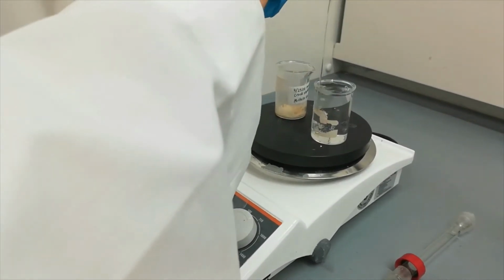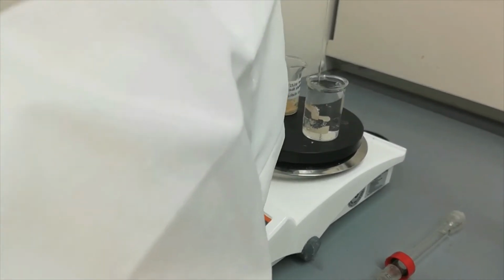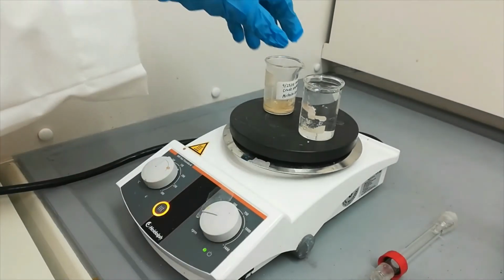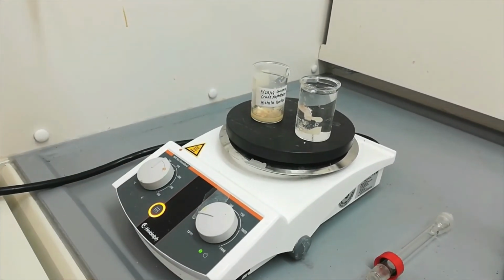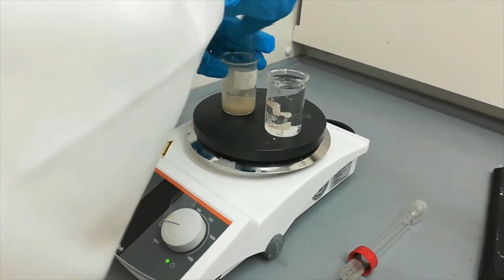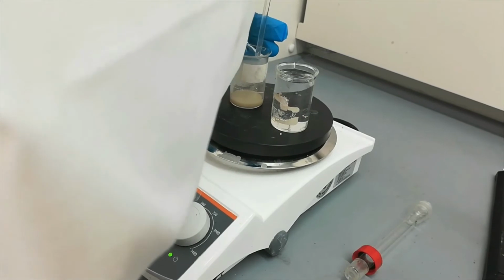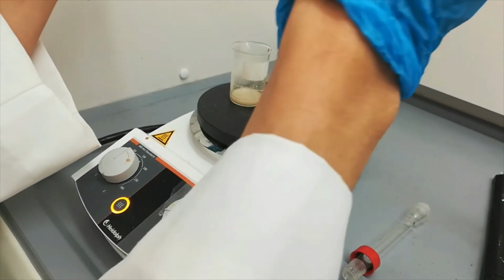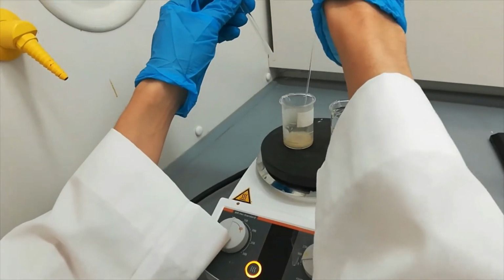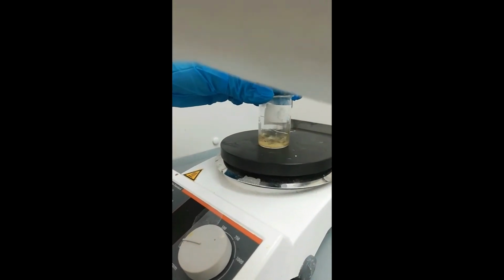Recrystallization, we have seen it before. The first step of recrystallization is to dissolve the crude product in a hot solvent until the product just dissolves. In our case, the hot solvent is 95% ethanol. We also stir the product using a glass rod just to make sure that the product dissolves completely and we don't need to add more solvent. In recrystallization, our goal is always to dissolve the product in as little hot solvent as possible.